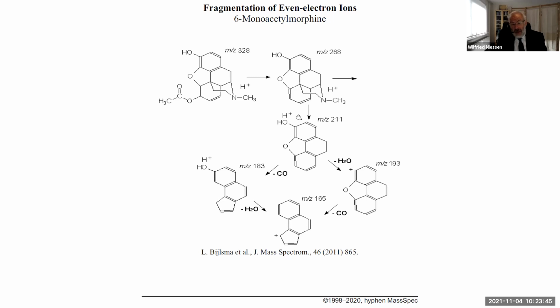a protonated molecule. And then for the low-end fragments, you see the loss of water, which actually comes from this side, and I have some evidence from labeled substances for that. So that's what we have, and it can show losses of CO. Alternatively, it can show loss of CO followed by the loss of water. So basically, you have the two possibilities, and you don't know whether it's going like this or whether it's going like this or whatever way it goes. Then you basically should start out with this structure and find out what is really going on, and so on and so forth.